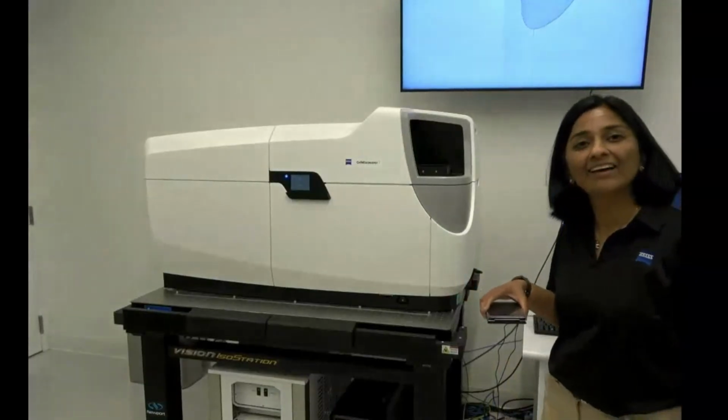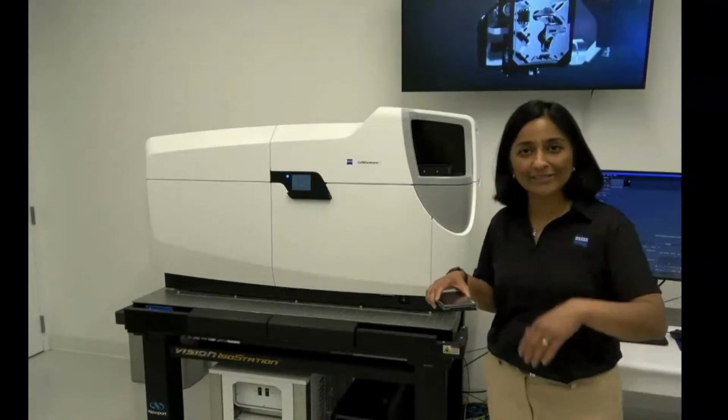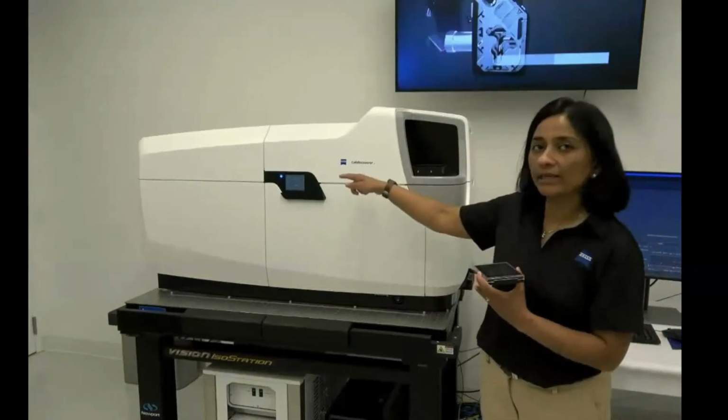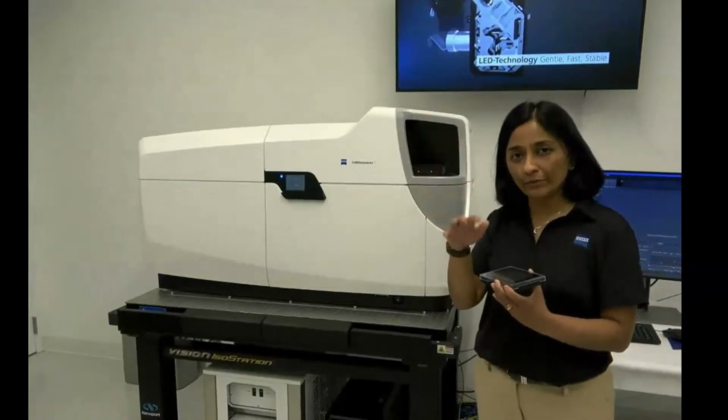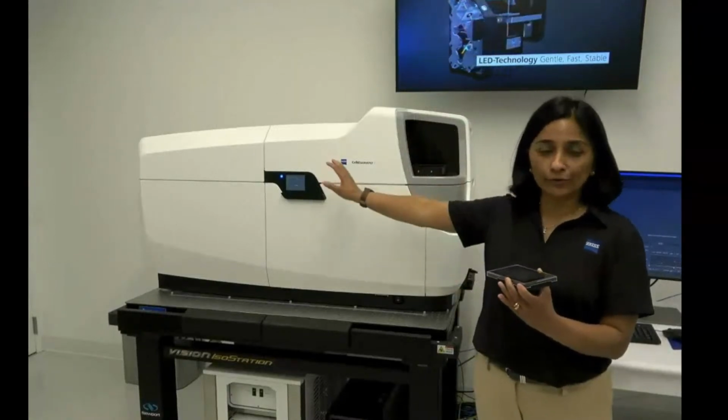Can you do analysis and acquisition at the same time from the TFT? Good question, Michael. Let's test it out. So your question is, can I run an experiment from the TFT that combines acquisition and analysis all in one experiment with a touch of a button, right?